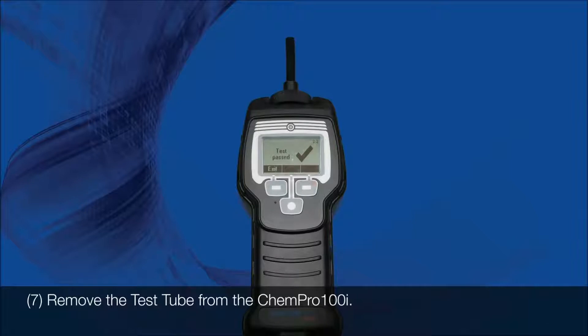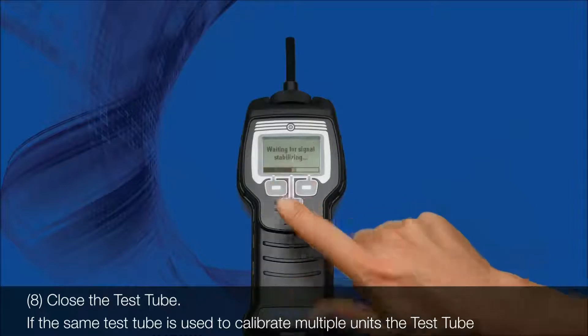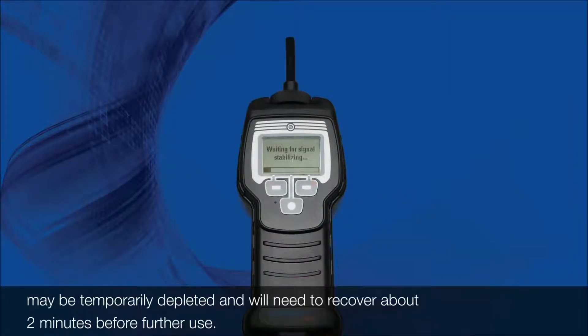7. Remove the test tube from the Kempro 100i. 8. Close the test tube. If the same test tube is used to calibrate multiple units, the test tube may be temporarily depleted and will need to recover about 2 minutes before further use.